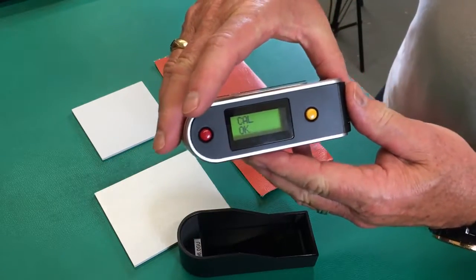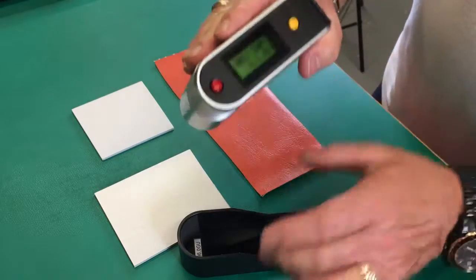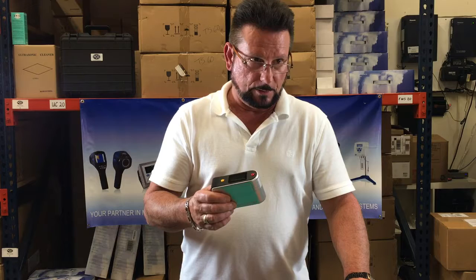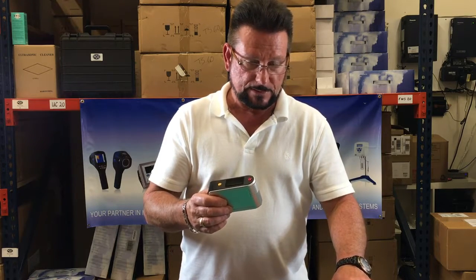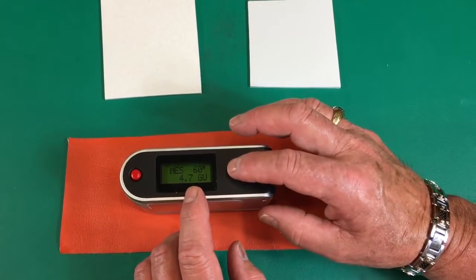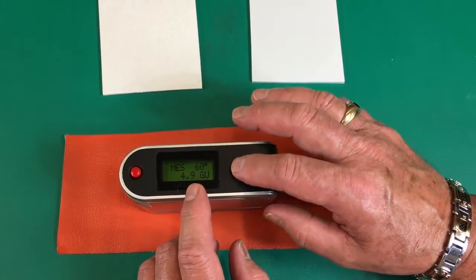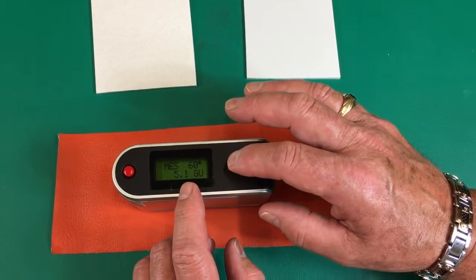Now we're ready to start measuring — push the yellow button again. Ready. This gloss meter projects a beam of light at a 60-degree angle onto a sample surface and measures the amount of reflected light in GUs, gloss units. We're going to measure this material in one place a couple of times until it stabilizes. It shouldn't vary more than 1.2 GUs.